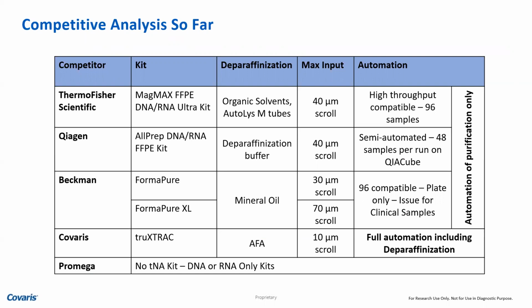One of the main reasons. That's why you start with a higher amount so that you have sufficient quantity that you can work with. And you don't necessarily need to worry about that. So no contamination, no temperature degradation, and the least amount of input volume that you will need to get to enough amount of DNA and RNA.